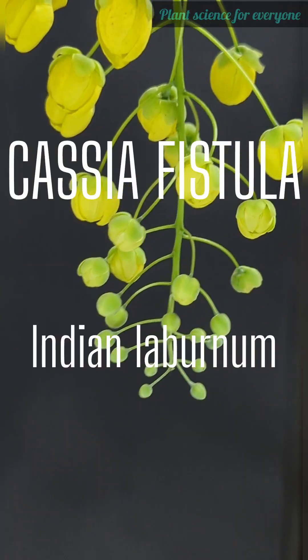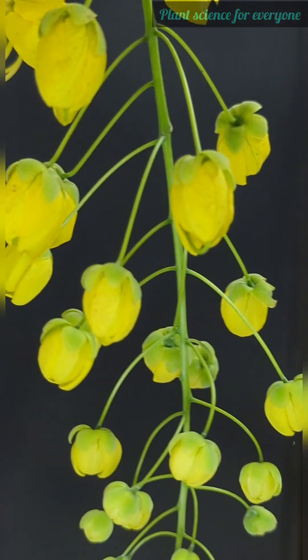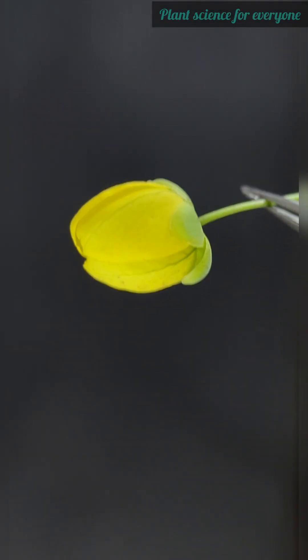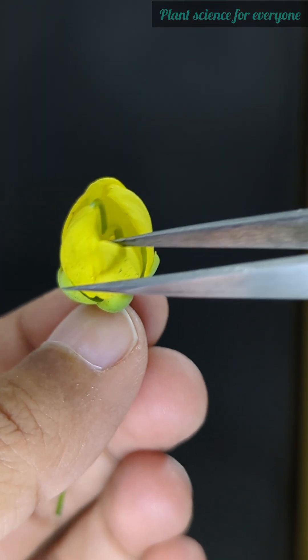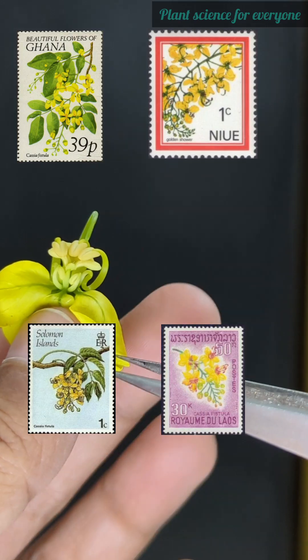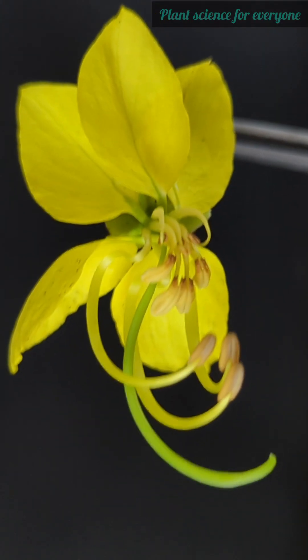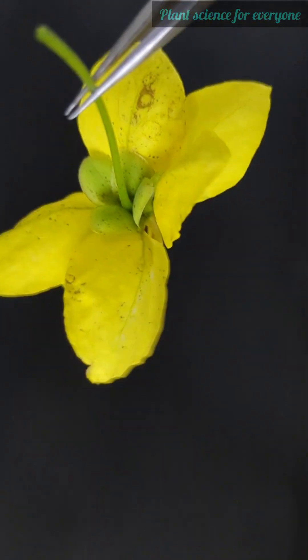Did you know this beautiful golden shower tree, also known as Indian laburnum, is the official state flower of Kerala? It is also the national tree and flower of Thailand, and its beauty has even appeared on postal stamps from different countries. Let's dissect the beautiful Cassia fistula flower and take a closer look at its fascinating parts.